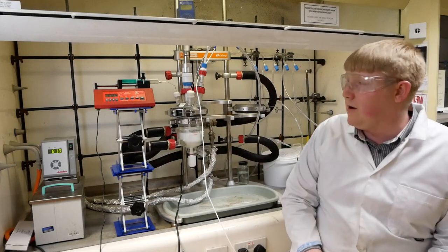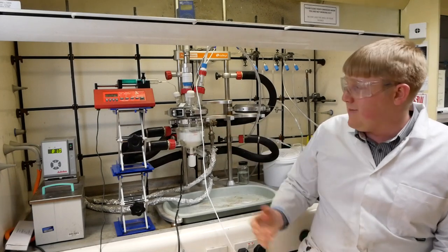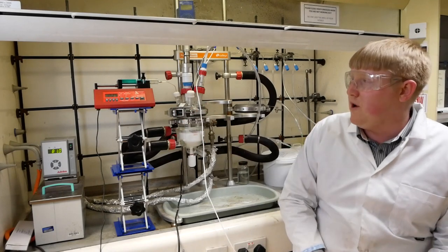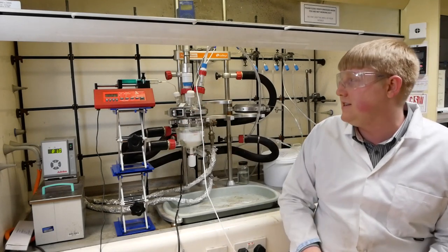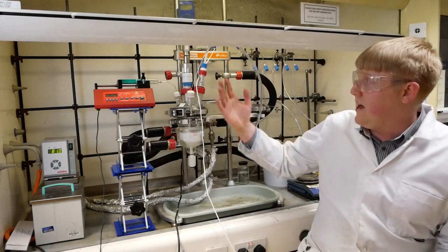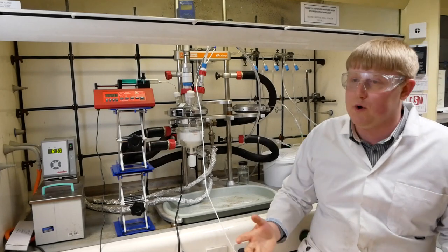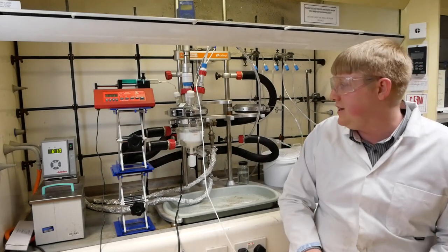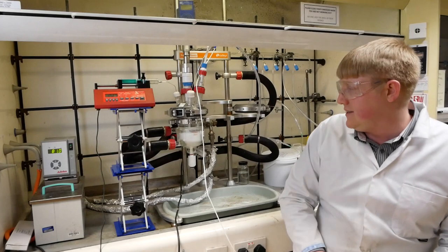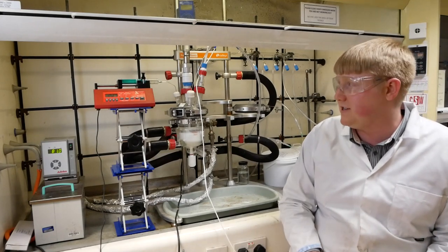You can see they give us a lot of opportunities for attachments. For example, here we can monitor temperature. We can tune how we feed in various reagents into the system. As well as that, we have powerful stirrers which are quite important when you're running any heterogeneous process. They're also jacketed which allows us to regulate temperature efficiently.